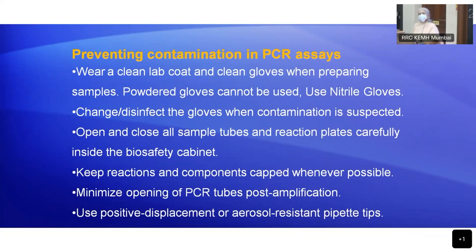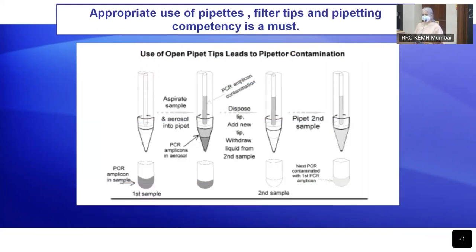And where possible, use positive displacement pipettes. Do you have positive displacement pipettes in your labs? So that does not generate so much of a negative pressure. It's under positive pressure all the time. So this is just an example of how a micropipette needs to be used.